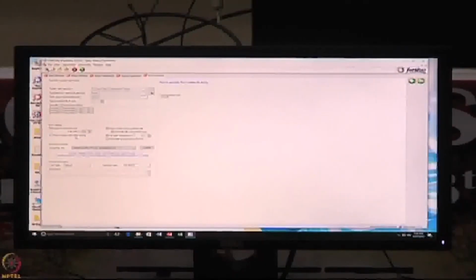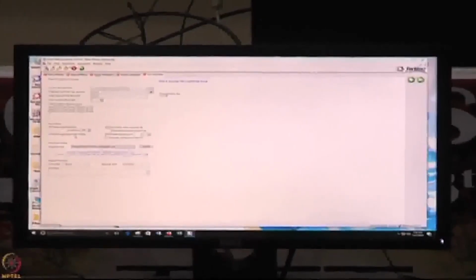Okay. Then if you look at run settings, there is delay experiment start and shake sample plate while waiting. What exactly is this? I mentioned earlier that the sensor comes dry, with a dry sucrose coating, but we have to hydrate it in your buffer. Whatever buffer you are using for your experiment, the sensor has to be hydrated. The minimum hydration time is 10 minutes. So what I did was, during my sample preparation itself, I first started the hydration, and then started the sample preparation.